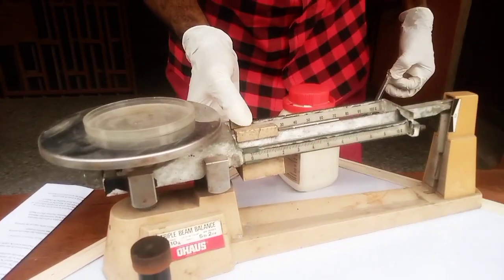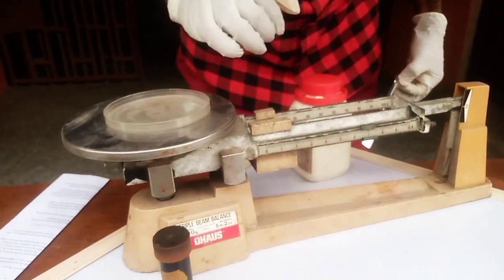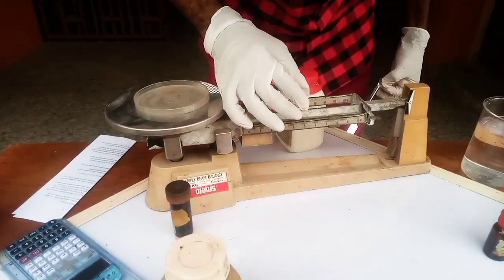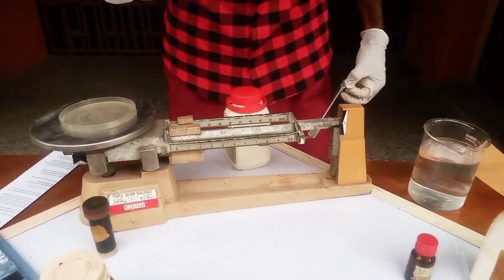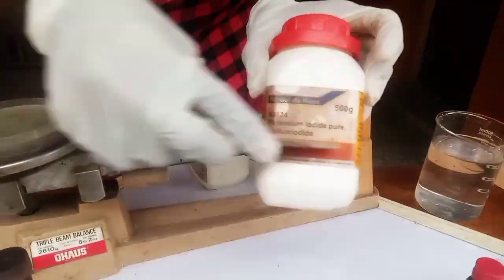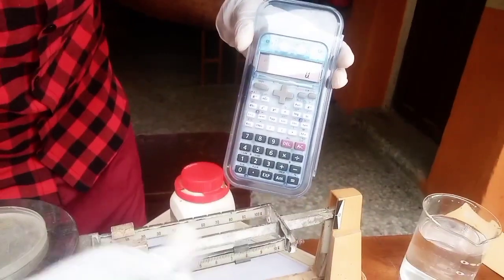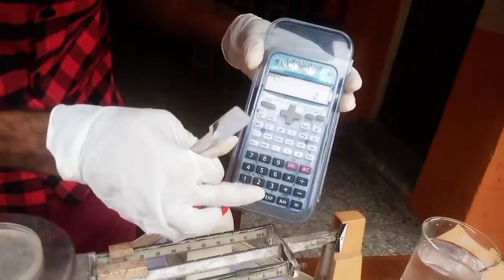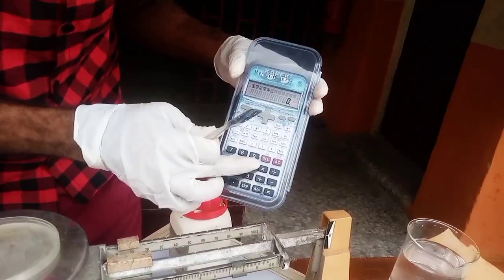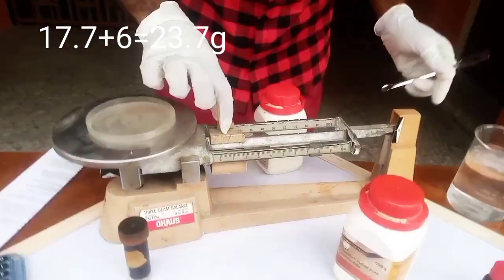They asked us to make use of 6 gram. Actually, to be frank, this 6 gram is too poor when we compare it with what is supposed to be, so that we will have a higher measure of iodine being dissolved. Therefore, I do the same thing again with this. I notice that the potassium iodide for me to do it is dropping at 17 point, which when added to the 6 is giving me 23.7.